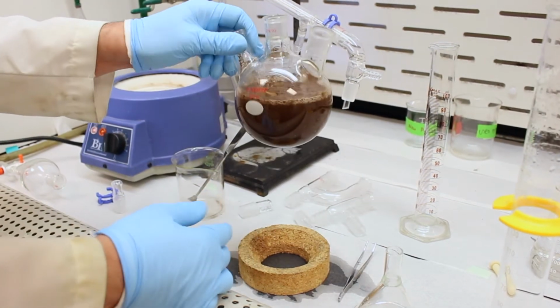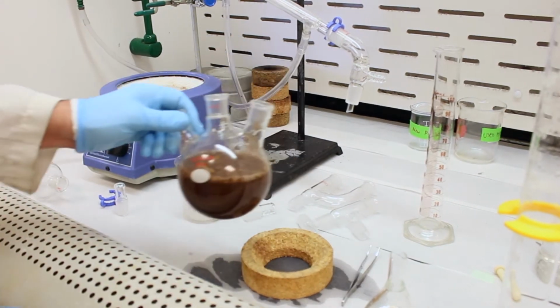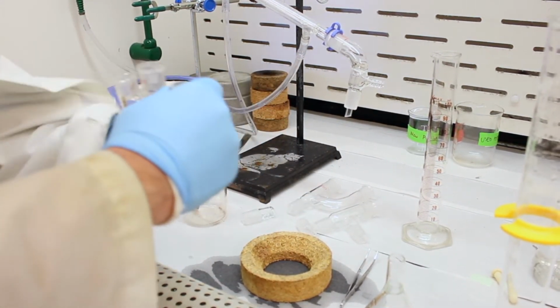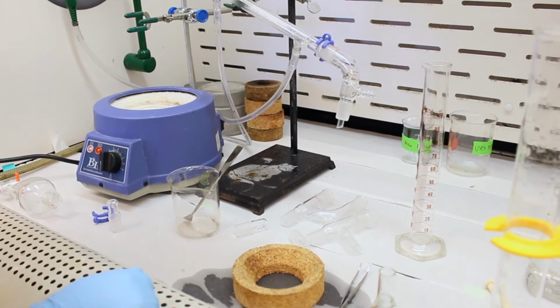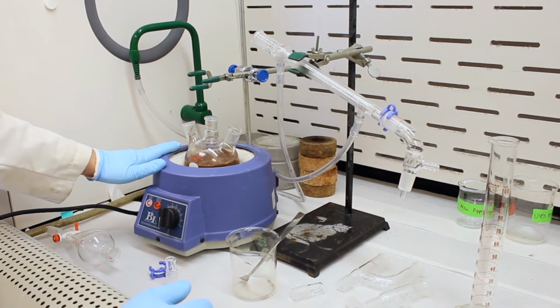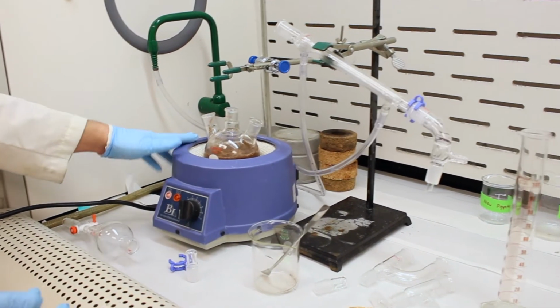And the spill is no big deal, just a little bit of water. Okay, so in fact, let me just wipe this down a little bit, the flask. We've got our allspice and water in here. We'll place it into the apparatus. So this is our heating mantle, which is going to heat the mixture.